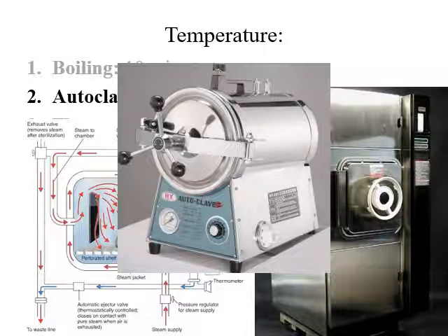But if you work in a dental clinic where they have a high turnover of patients, where there are lots of people going to the clinic every day, and you have to sterilize dental instruments in a larger volume, you'd probably have a larger autoclave like the one on the right.